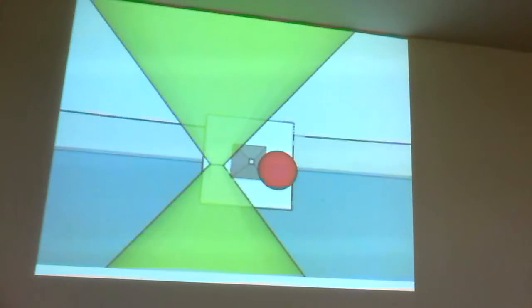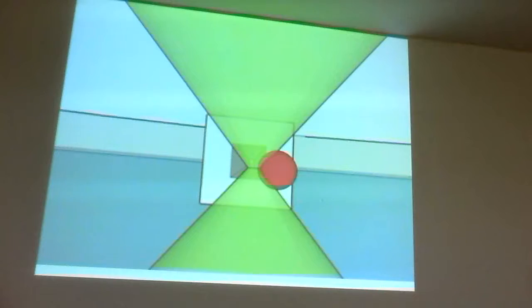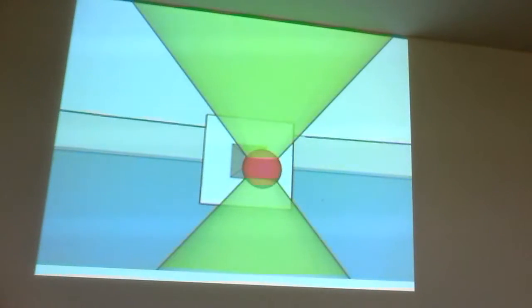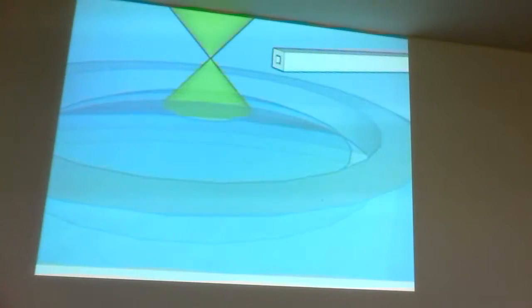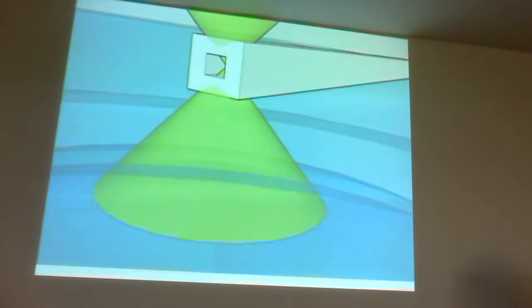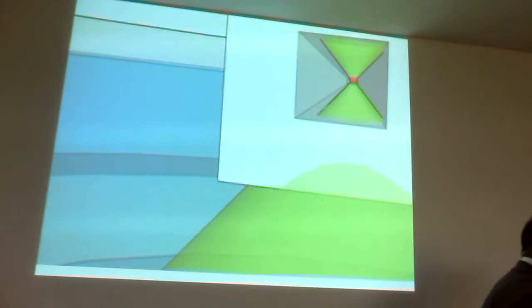And that's a red blood cell that you might trap. So that gives you a feeling of the scale there, of the size of the beam. That's actually absolutely to scale, that little drawing. And here we're just going to grab it and move it into a capillary. Okay, so you can trap a cell, you can trap a bead. We don't trap single molecules directly because of this polarizability. So what do people do?